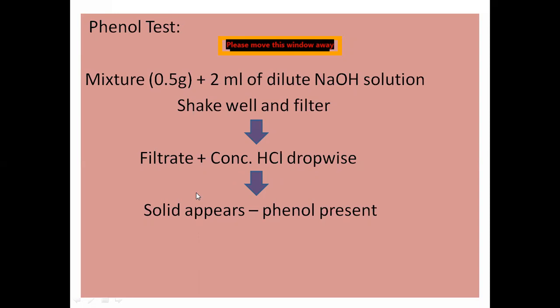And generally, for the water soluble compound, you will get normally acid. Water soluble acid might be, because generally liquid phenols are carcinogenic or harmful to the skin.